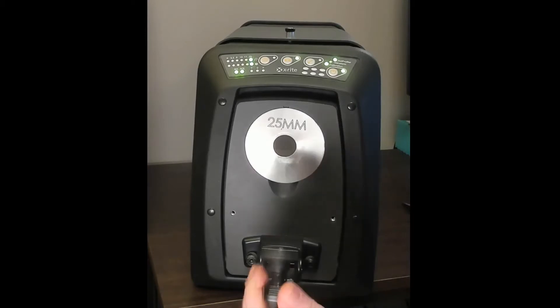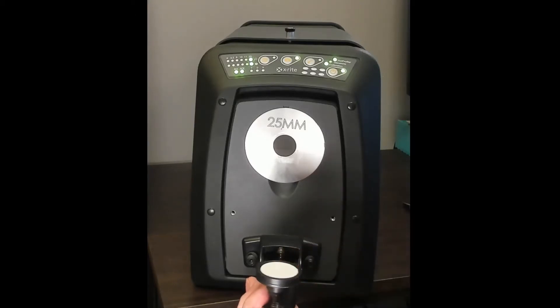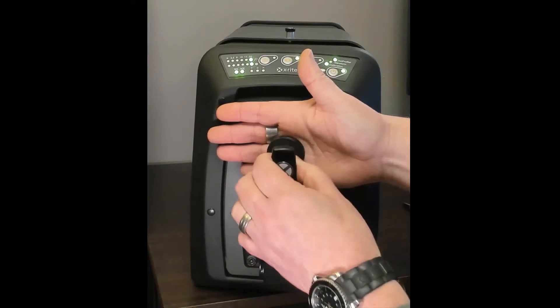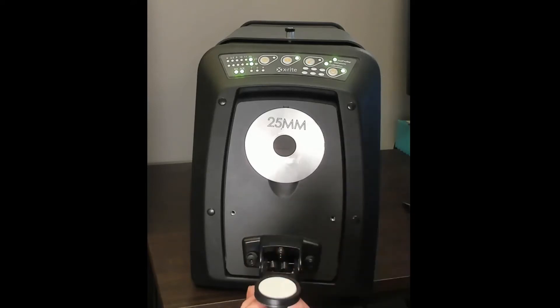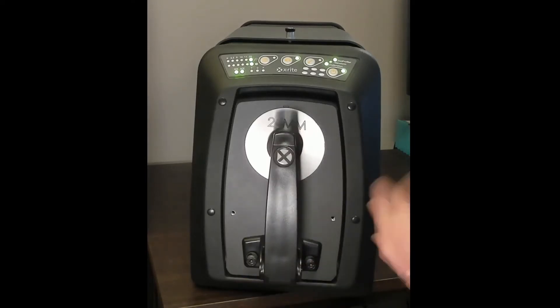Let's talk about the sample arm. It has a white ceramic backing. When you're taking a measurement, if the sample happens to be transparent rather than completely opaque, any light that passes through will hit this white backing and bounce back into the instrument. Optionally, you can also purchase a black backer depending on your samples. The sample arm also has a dampener — if you flip it up, it catches and slows itself down so it doesn't smash into the aperture plate, which would break the ceramic backer and damage the sphere.